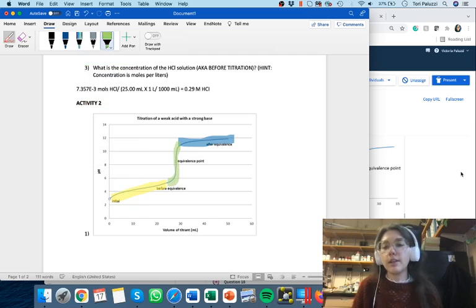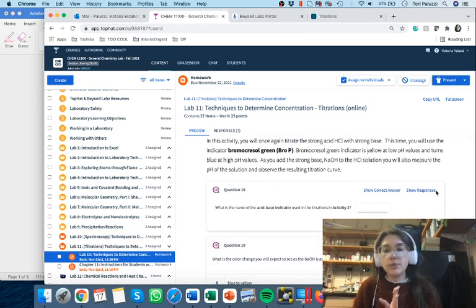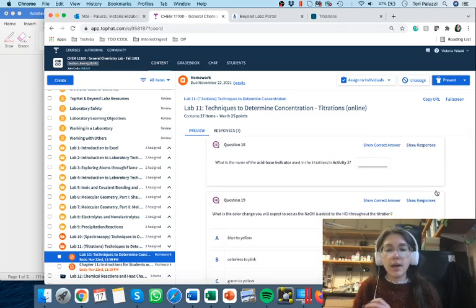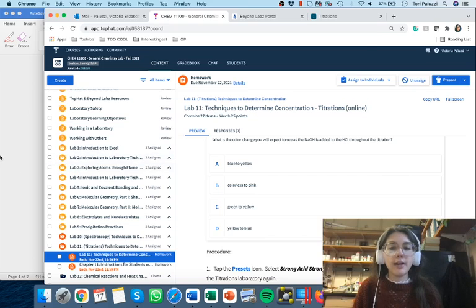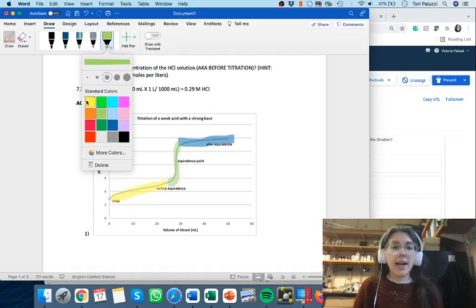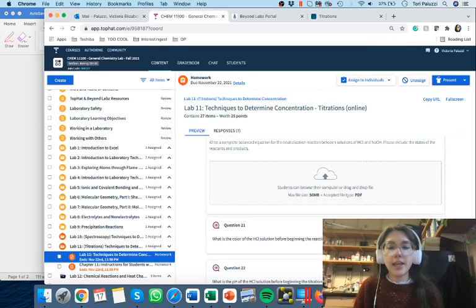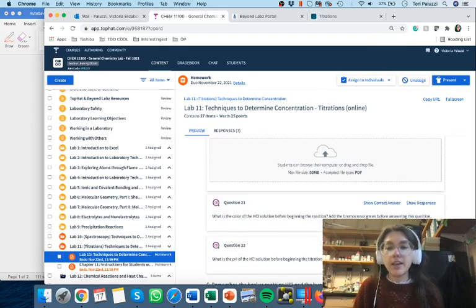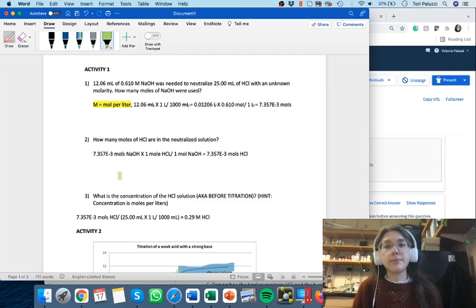So you're going to use bromocresol green to find that color change. Remember, you're going to be starting with acid and ending with a basic solution. Then you're just going to record these same things and do the same calculations that we did above. Okay, so I think that's all for Lab 11.